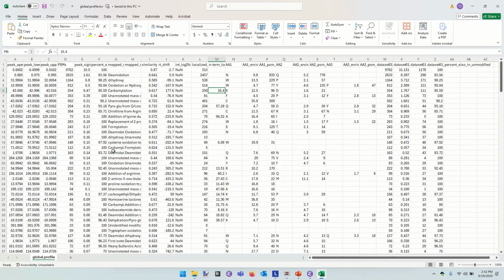Yeah, the chemistry is quite the same. In the case of lysine, you just have a long alkyl chain with an N on the end of it. In the case of an N-terminus, it's not on a long alkyl chain. It's just the end of an NCC backbone. But both of them are just a primary amine, and both of them can take on the same modification. So the carbamylation might happen at an N-terminus, or it might happen at a lysine.